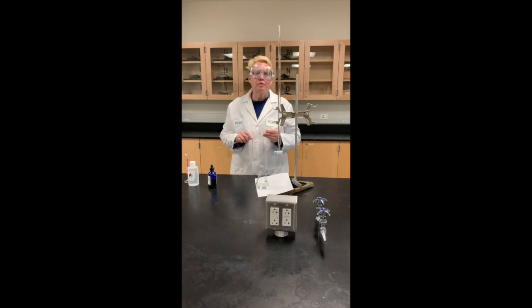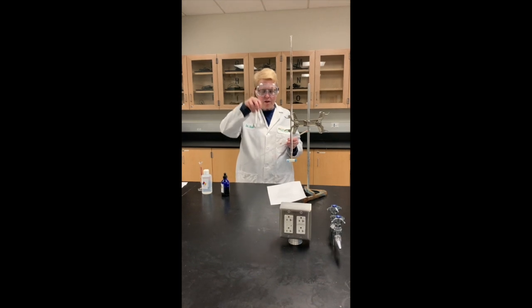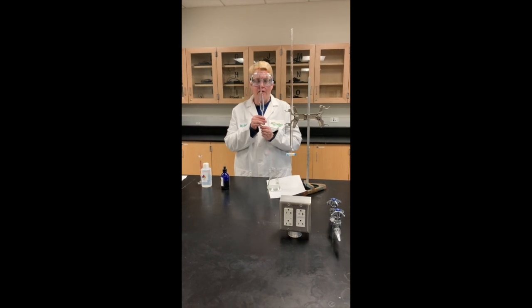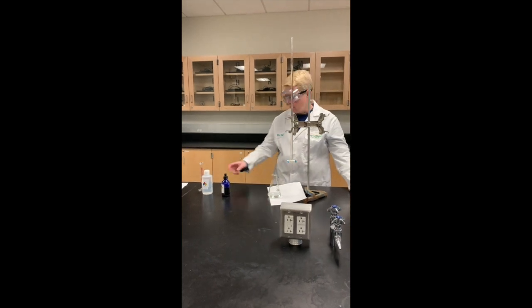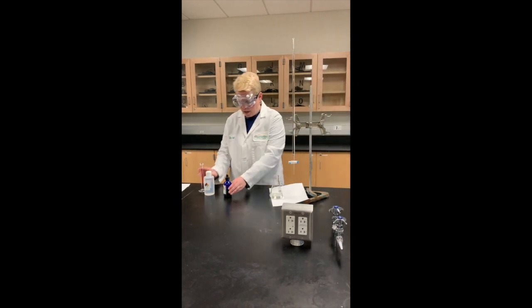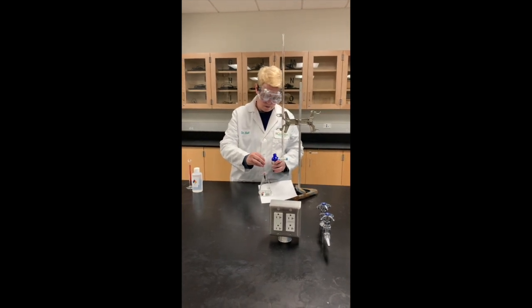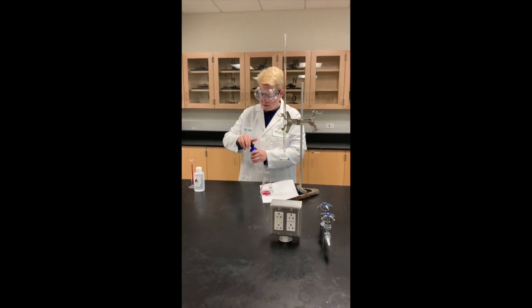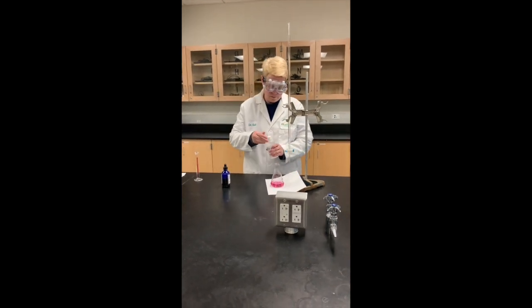So for the last part of this experiment, now we have standardized our EDTA, so we're going to figure out the actual calcium carbonate content of hard water. And to do this, what I did was I took a 50 milliliter volumetric pipette and used the same pipette pump and dispensed it into this flask. And now we need to add our 5 milliliters of buffer to that, along with our 8 drops of Calmagite. And then finally, we're going to add our 15 drops of the magnesium chloride solution.